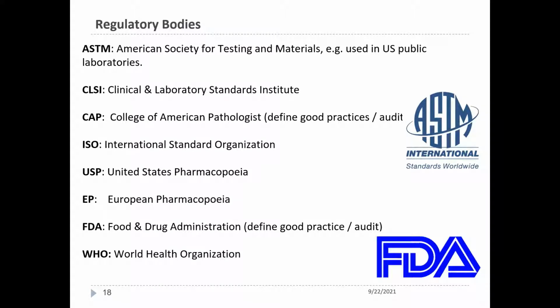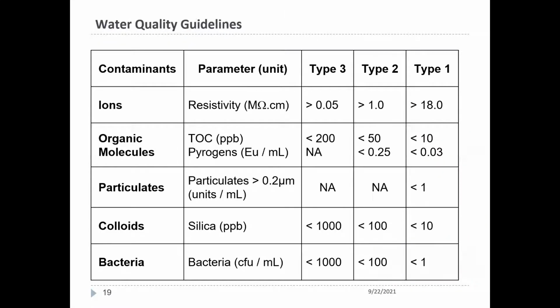This is to show you that no matter the industry you find yourself in, there are a set of rules that apply to your industry. So it's good to go back and look at, if I'm a clinical or biomedical laboratory, what's the regulation? What does the standard say pertaining to the quality of water I have to use in the lab?